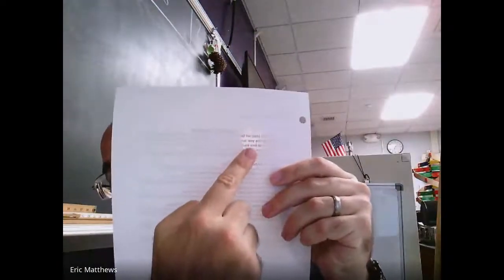And let me make sure. I rub the potato right here. There's nothing. No lipids in the potato. So that's how you're going to do your lipid test. Pretty straightforward. Remember, look for that shiny bit that lets light through it. If you see that, yep, then it's got some oil, some fats.